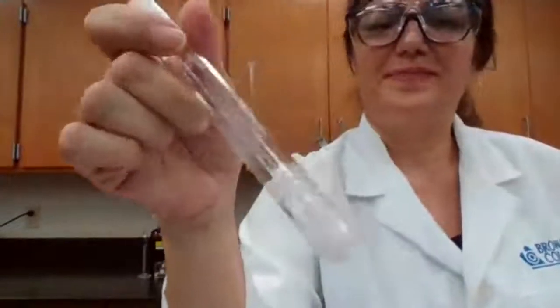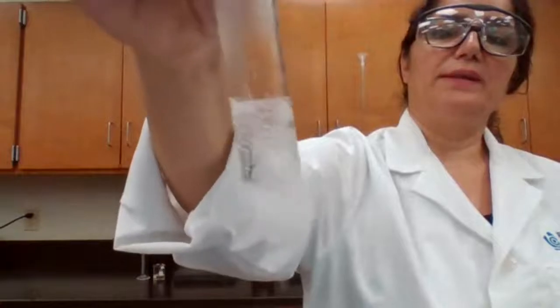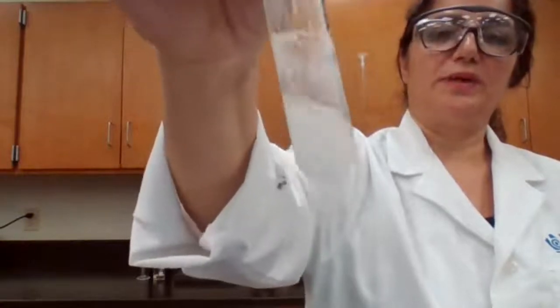It worked. Okay, this is the ammonium chloride placed in the ice bath. So we're going to take it back.